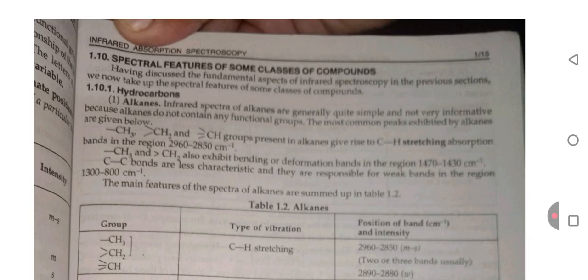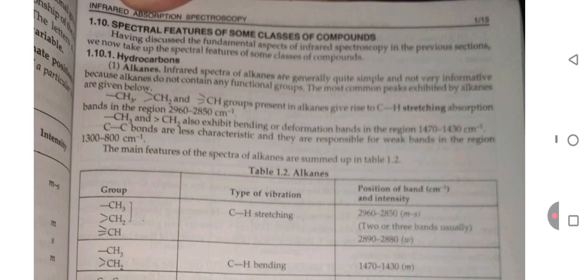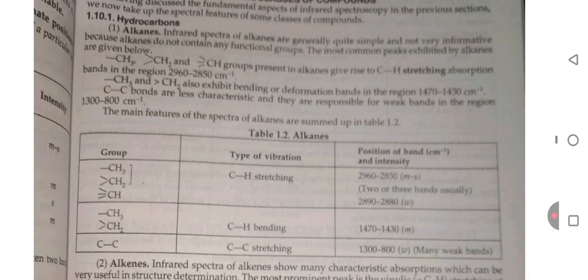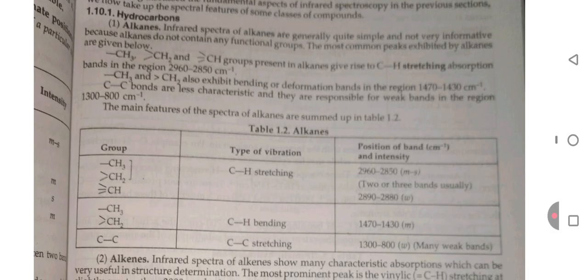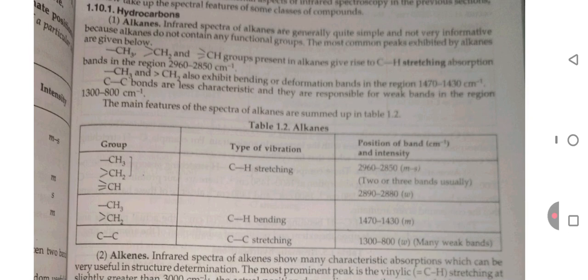Spectral features of some classes of compounds. Having discussed the fundamental concepts of infrared spectroscopy in the previous section, we now take up the spectral features of some classes of compounds. Hydrocarbons. First, alkane. Infrared spectra of alkanes are generally quite simple and not very informative because alkanes do not contain any functional group. The most common peaks exhibited by alkanes are given below.